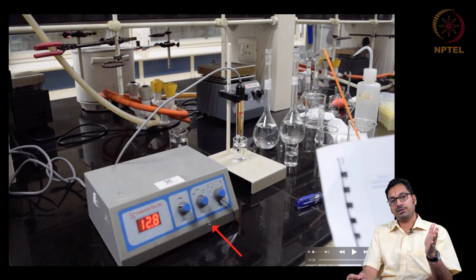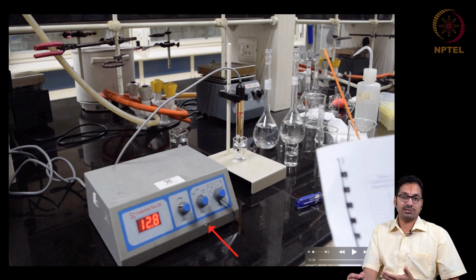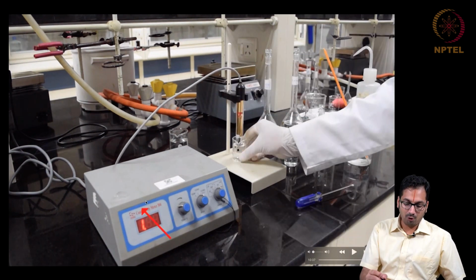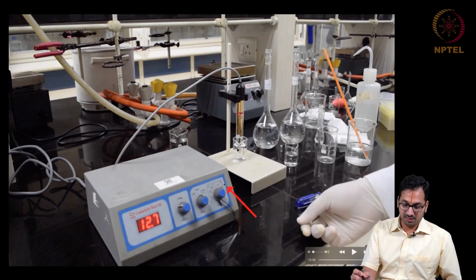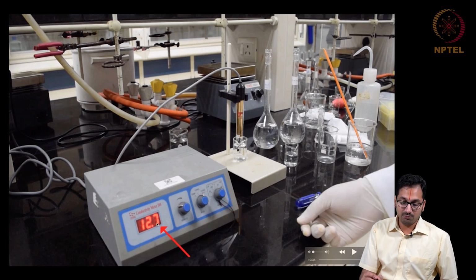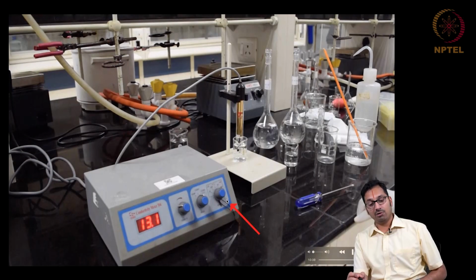The next measurement that he ends up doing is for a higher concentration of KCl. So you are going from 0.01 molar to 0.1 molar. As you realize, conductance increases with the concentration of the ion. When you increase the concentration, you realize the value went outside the detection limit at the 1 millisiemen setting. So what one has to do is to change the equipment such that it can carefully measure values up to 20 millisiemens, and that's essentially what is being done. When you increase the concentration of KCl, conductivity increases and you are able to carefully measure it by changing the setting in the conductometer. If you have not done this, you are going to have trouble.